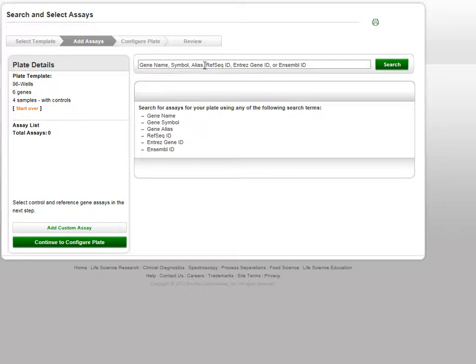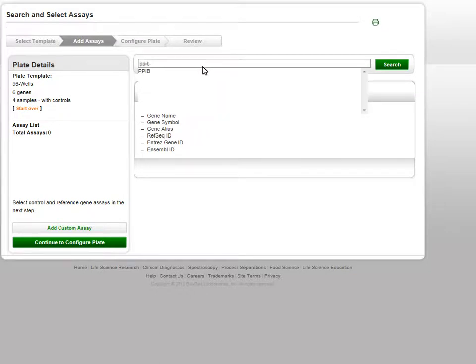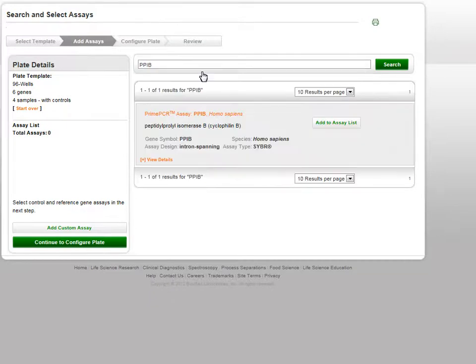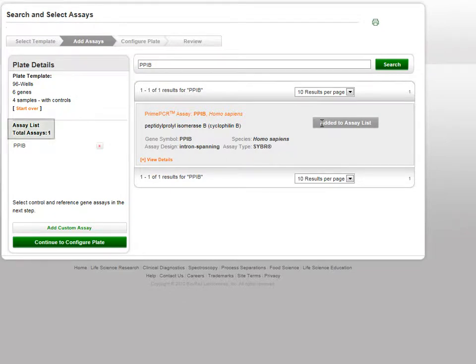Here you will search for your assays of interest by entering your keyword in the search bar. Predictive search is enabled. When your search results are returned, click on the Add to Assays list. The assay will be added to your assay list at the left of the page. An assay count is included to help you keep track of how many assays you have selected.